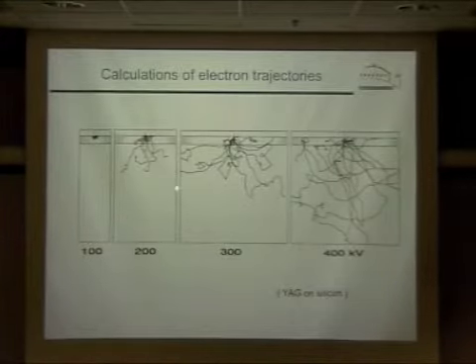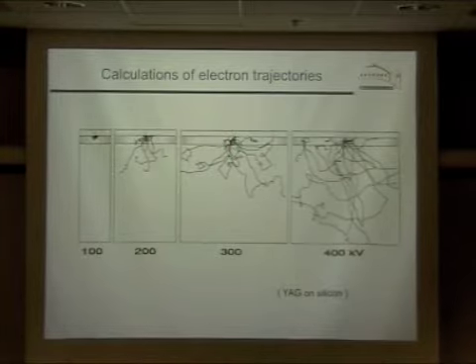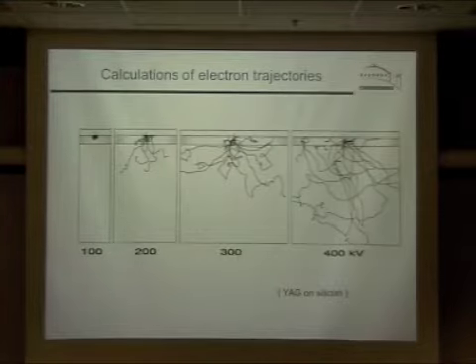The fact that, first off, the electrons go through the scintillator. So say at 300 kV, almost all the electrons go through the scintillator. A few of them actually get scattered within the scintillator, and this one here goes sideways. This one here loses all of its energy in the scintillator, and that produces 300 kilovolts worth of light.